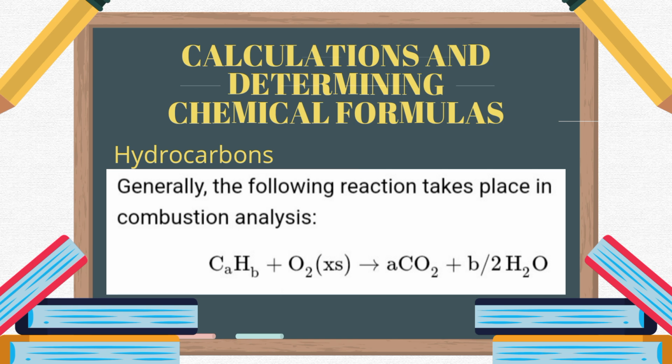So again, all carbon is converted to carbon dioxide or CO2, and all hydrogen is converted to H2O or water. So that is the reaction in combustion analysis.